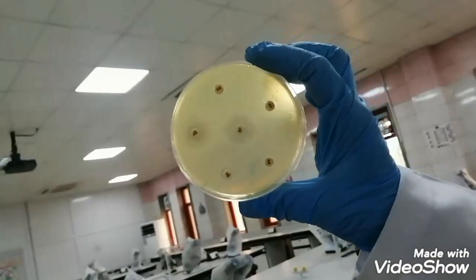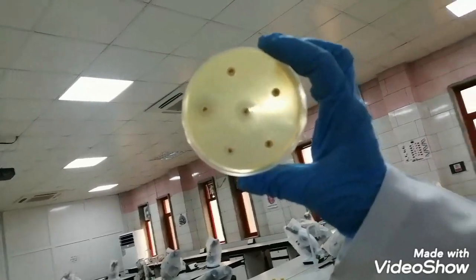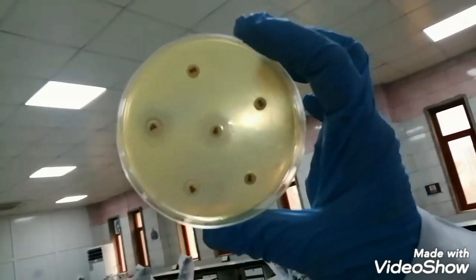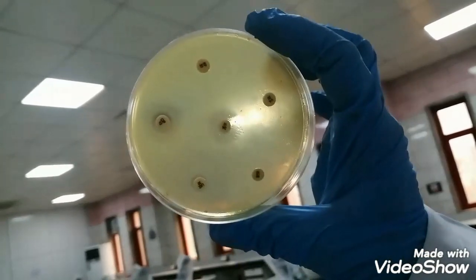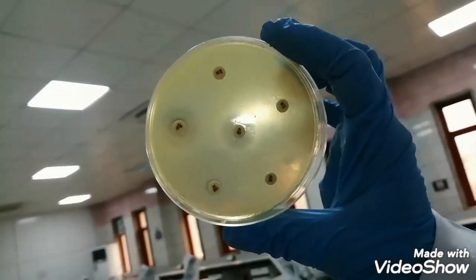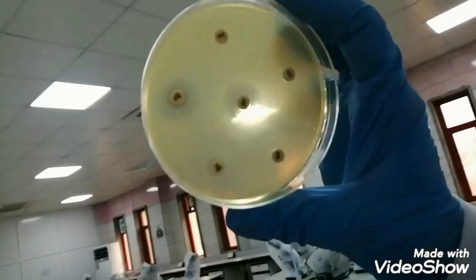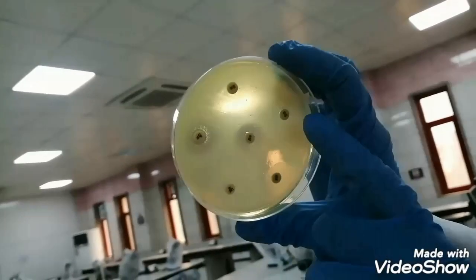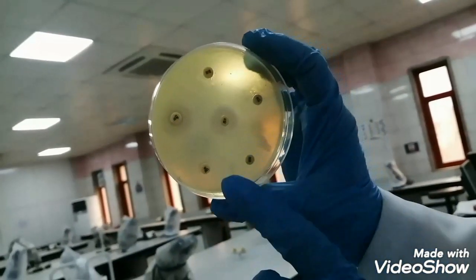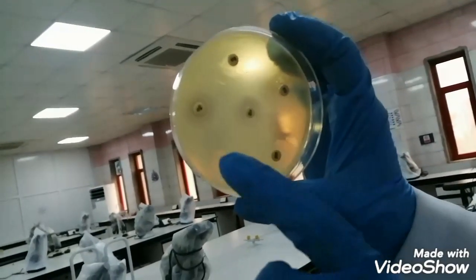Another type of culture media is the Mueller-Hinton agar. This Mueller-Hinton agar is used for the antibiotic sensitivity test. The method is we take the Mueller-Hinton agar inoculated with the microorganism that we need to test for its sensitivity to the antibiotic, and we put the antibiotic discs. These are antibiotic discs. They come ready, with a known concentration, according to what is available from the manufacturers.